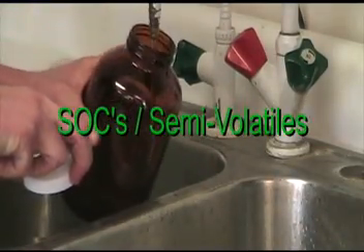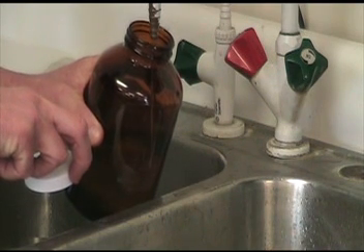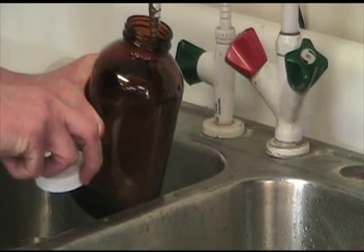Sampling of semi-volatile compounds, or SOCs: simply run the water from the designated site 3 to 5 minutes, then fill the bottle to the top and cover. Transport sample to the laboratory at 0 to 6 degrees centigrade.